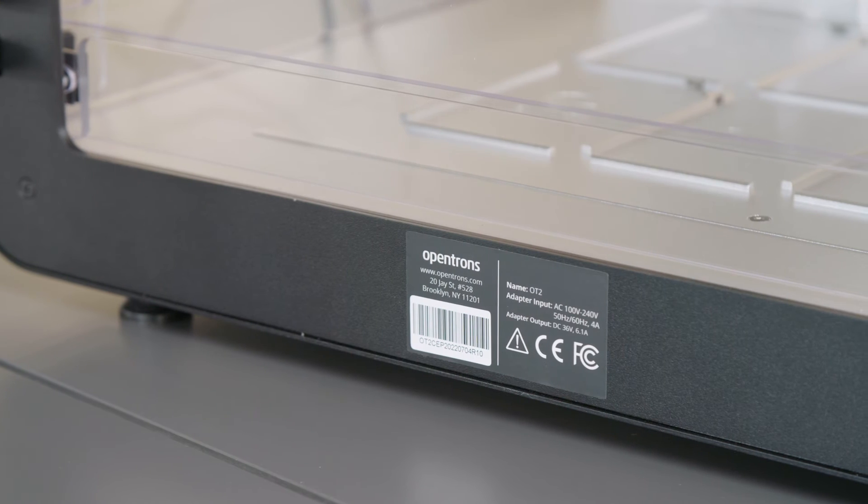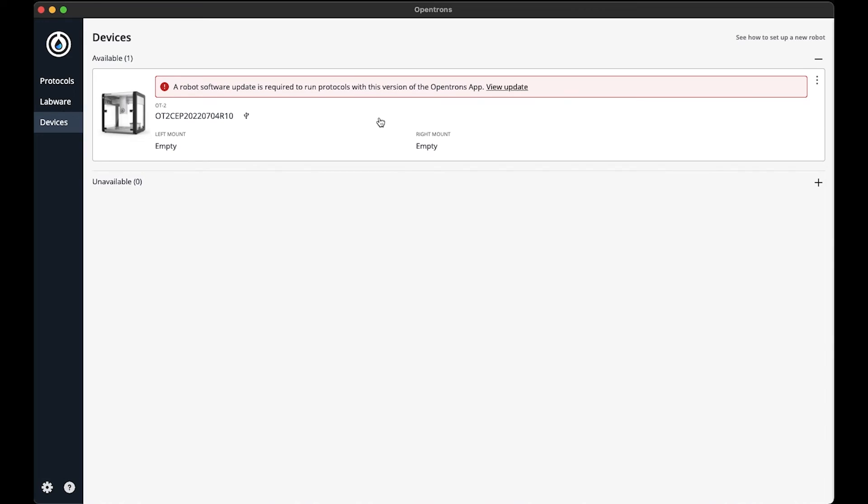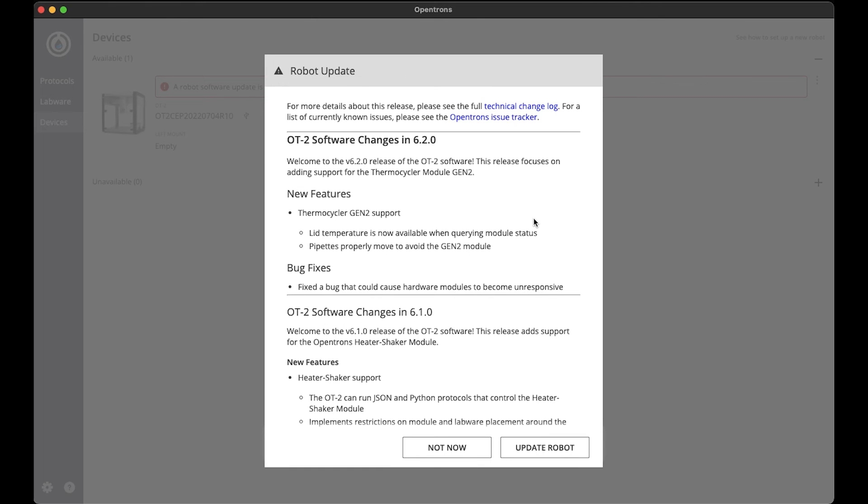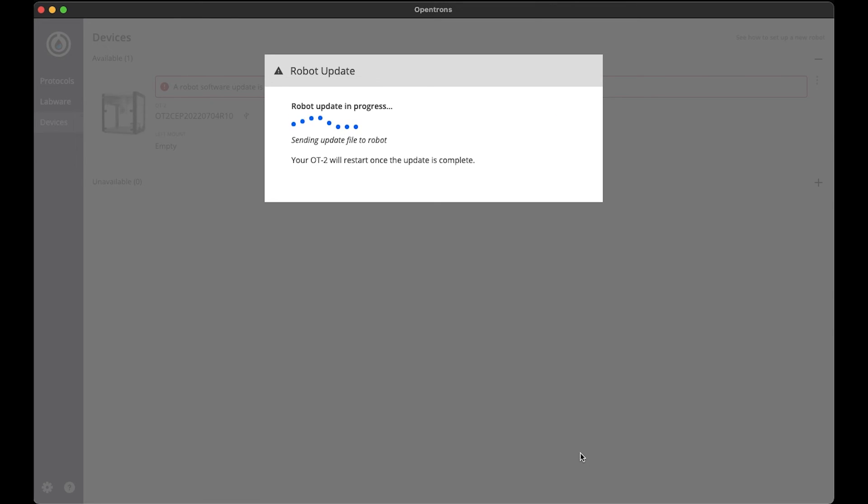Since my OT2 is new, there's a red banner telling me to update the robot software before I can run a protocol. I'll go through that very quickly. I will just view the update and update the robot. It will take a few minutes for the robot to update.